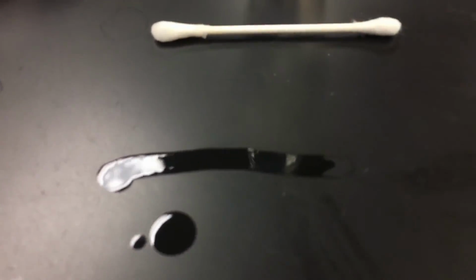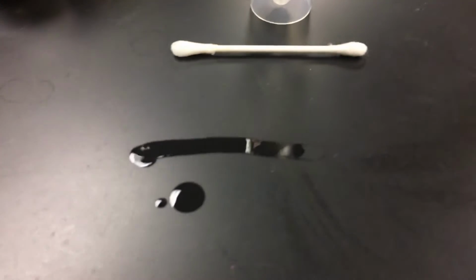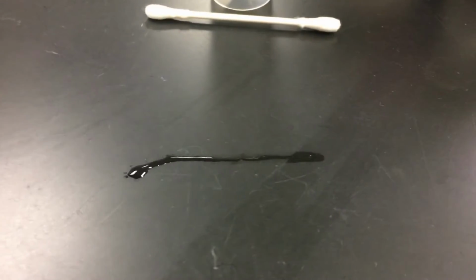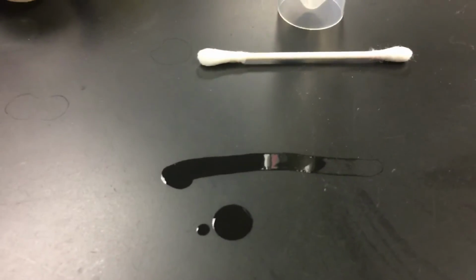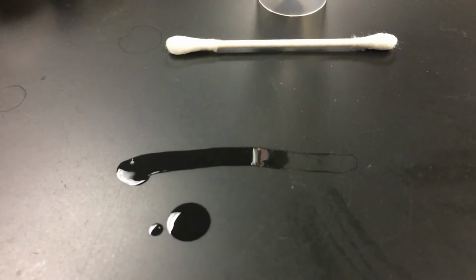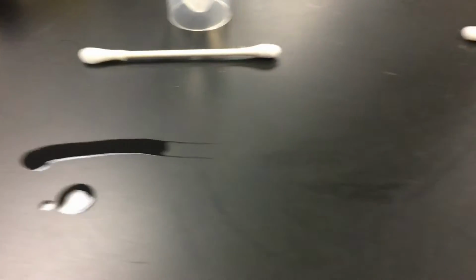Okay, these are both holding up pretty decently as far as evaporation goes, but based on the viscosity, oh, this one's starting to evaporate. Okay, based on the viscosity and the surface tension, we are seeing that our ethylene glycol has some stronger intermolecular forces, which is a little interesting. That one continues to evaporate. This one's still holding together pretty well.